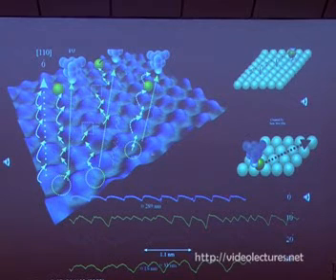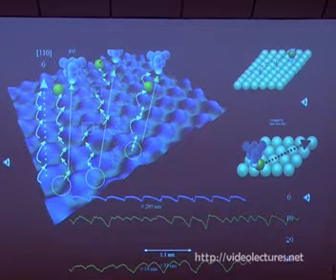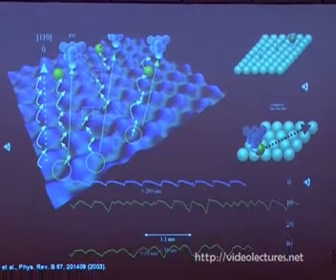So in this case, the atom moves the first two steps smoothly, and it goes along the different directions around these atoms, and moves again around these atoms. It moves smoothly, so the curve is a smooth curve and the sound is different. Let's see, now we hear that sound.